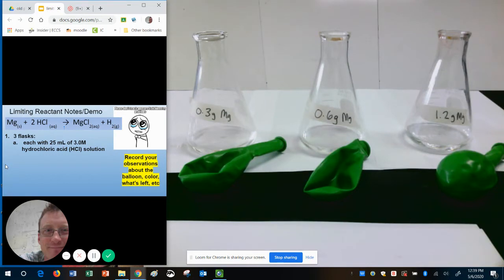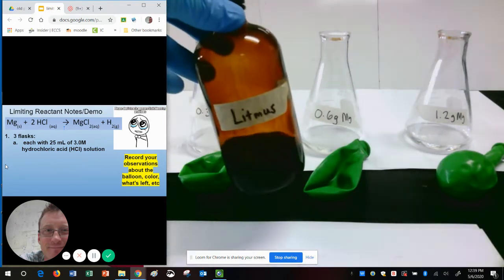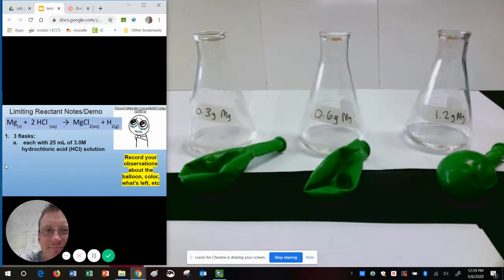The problem with this reaction is you can see it reacting but it doesn't have any colors or anything. So what I'm going to do is I'm going to add to our reaction what's called an acid indicator. So the one we're going to use is litmus. Litmus is an indicator that changes color based on whether or not acid is present or absent.